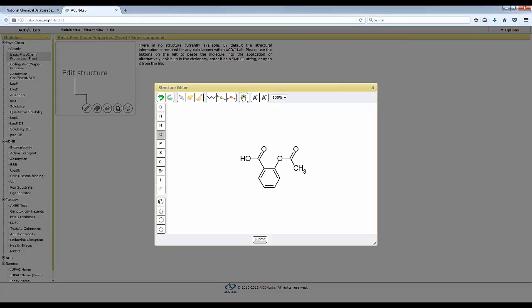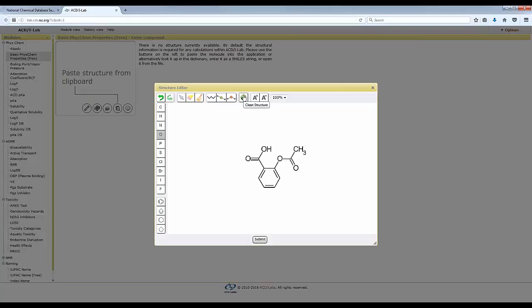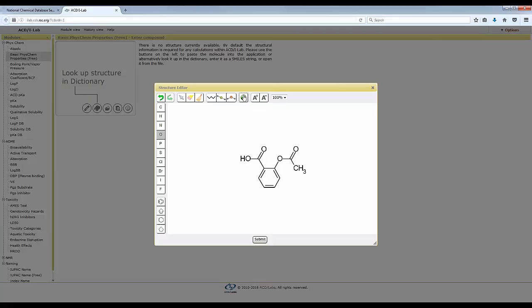Now, you see what happened here is that I had it a little bit, and I didn't quite click on the atom, so it just added another ethane molecule there. If you did a mistake, you can click the undo button and the undo button again. So let me be a little bit more careful. There you go. And I can add maybe another oxygen here and make this bond also double. And we have a nice aspirin molecule. Now, if you want to make it a little bit looking better, because you see some of the bond angles are not quite correct or whatever, you can click this clean structure icon, and this will make the structure look a little bit neater.